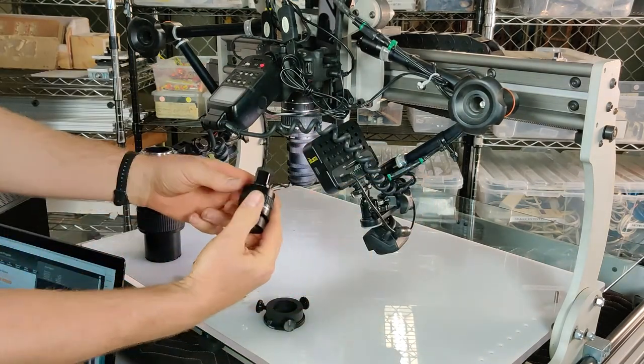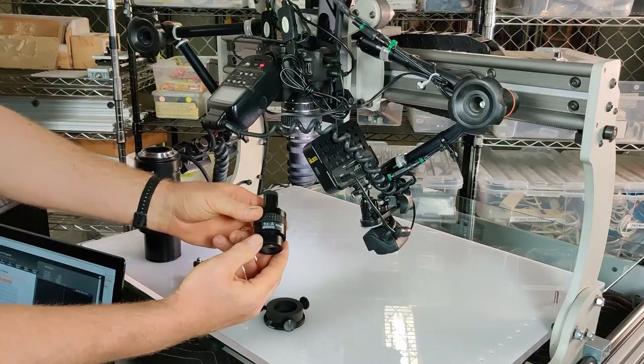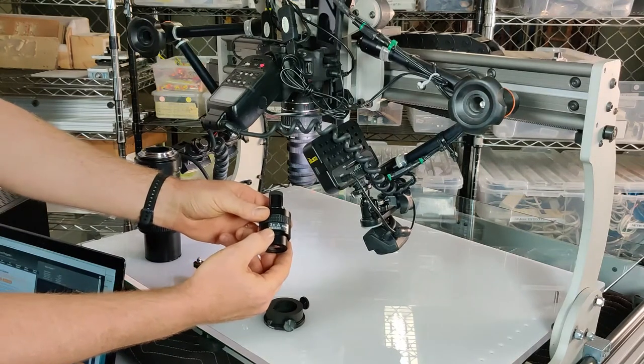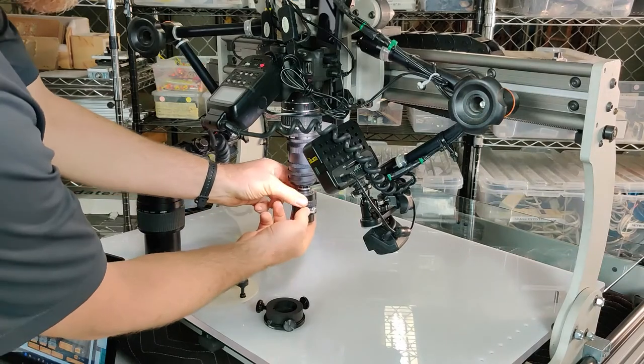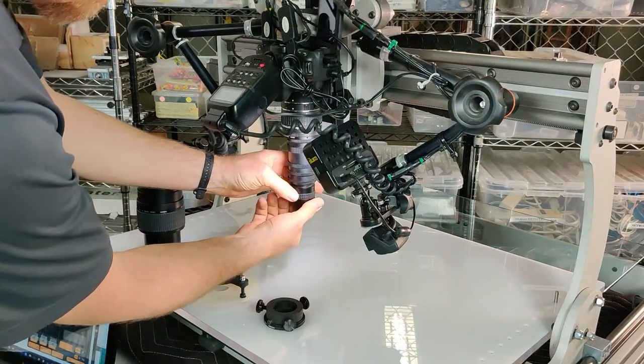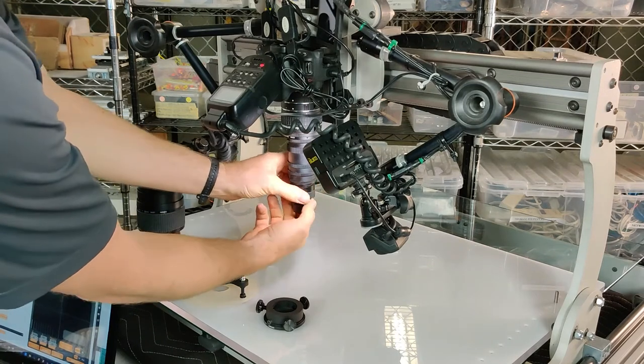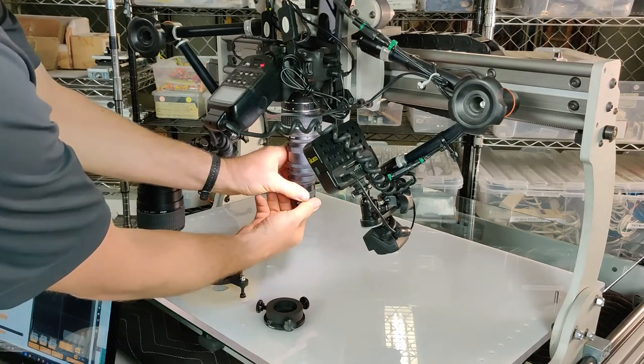Then I'm going to attach one of the three microscope objectives — 1x, 3x, 5x, or 10x — to the adapter stack. Just like so.